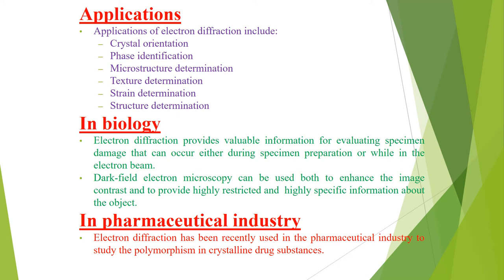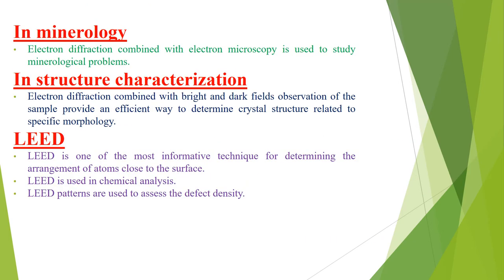In the pharmaceutical industry, electron diffraction has recently been used to study polymorphism in crystalline drug substances. In the field of mineralogy, electron diffraction combined with electron microscopy is used to study mineralogical problems.